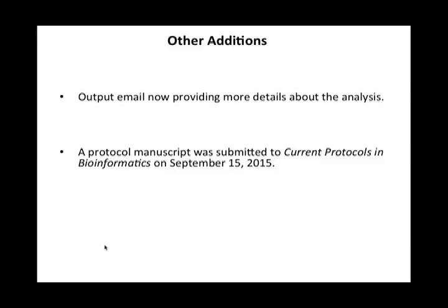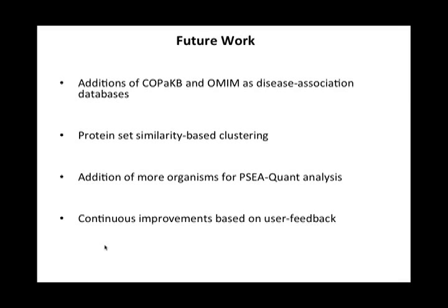And both of these tools are basically replicating the web interface of PSEA-Quant, so users that are familiar with one of the interfaces can make the transition very easily. And the IP2 integration of PSEA-Quant was done by Robin Park, and I thank him also for that.